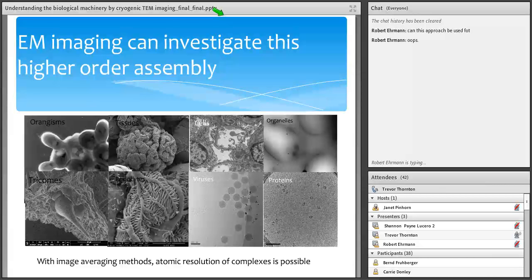No, and so Katja is an expert in aberration corrected microscopy and spectroscopy of elements, and so they look at atoms routinely in non-biological materials. And the reason they can do that is because the materials are conductive and they withstand large electron doses. Biological molecules do not withstand large amounts of electrons. We know that because if we get struck by lightning, we don't survive that very well, whereas the metal pole next to you does just fine. Yeah, you're right. Oh, we have a question, Dwight.